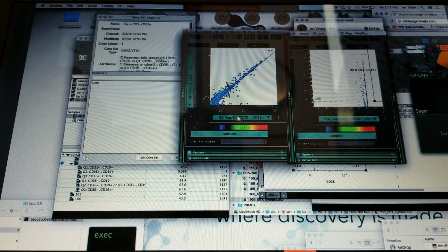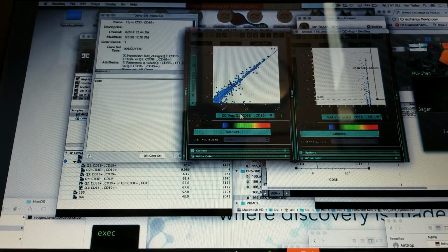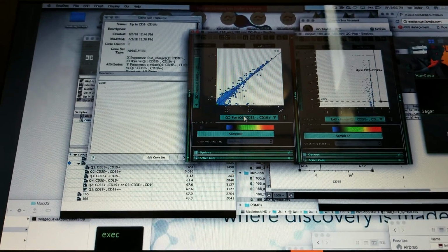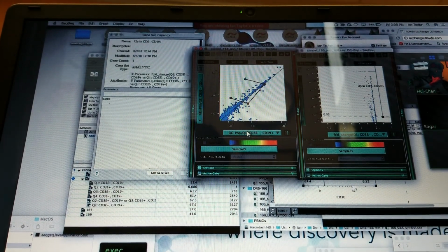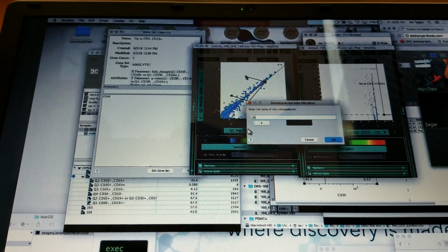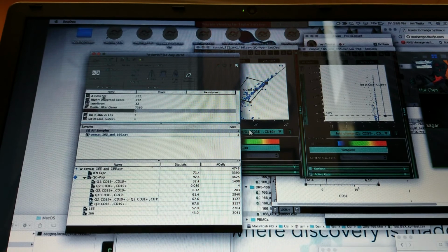Okay. And then how did you get that to go up to the gene set? I'm sorry, the top window. Yeah, so I can draw gates; it's usually more relevant to draw them in this volcano plot. But I can also draw gates of any kind within this comparison plot. And when I click OK, I'm going to get a gene set calculated back in this.